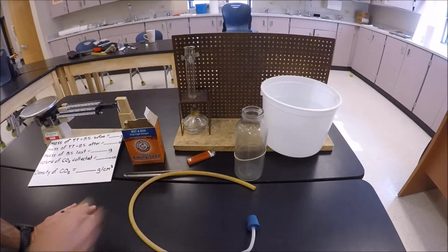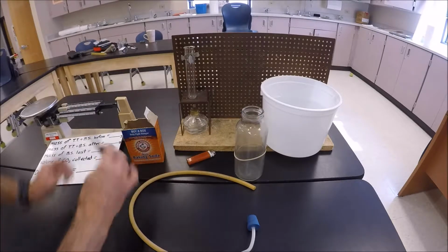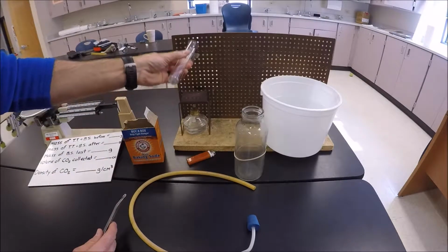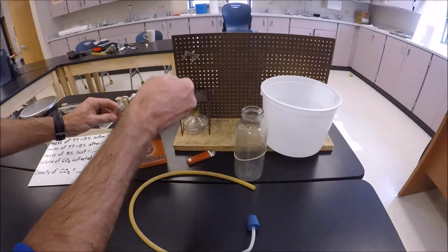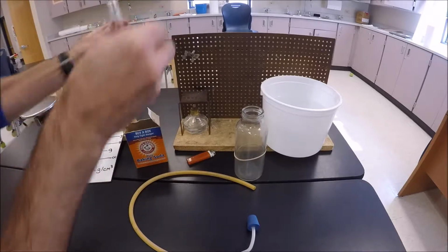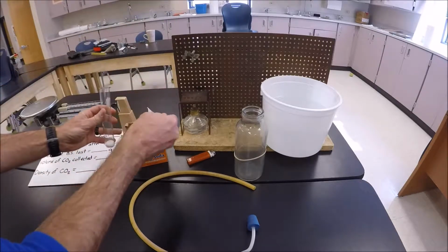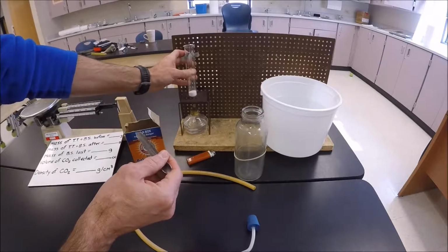What we're going to do is essentially take this test tube. We're going to get a small amount of baking soda, maybe 2 of those scoops or so, something like that. And we are going to heat it up over the alcohol burner.